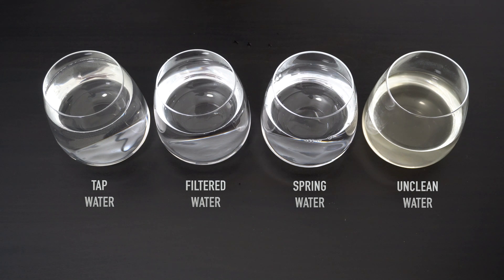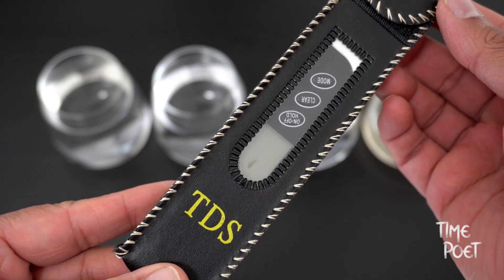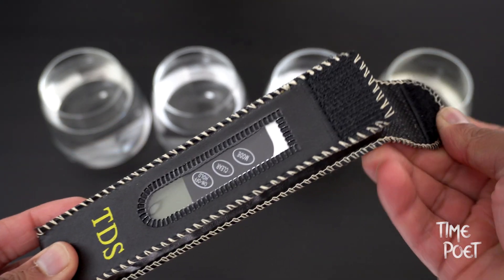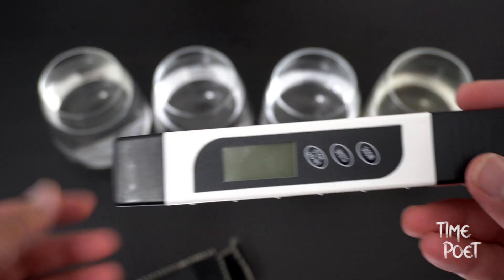For this experiment I have taken tap water, filtered water, bottled spring water, and some not-so-clear water. To help us find the quality of water, we will use this $10 device that lets you find the total dissolved solids in water.